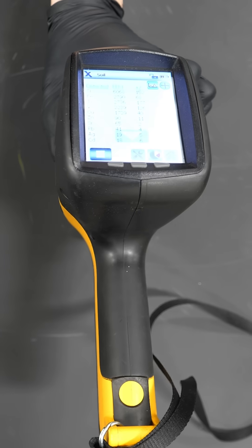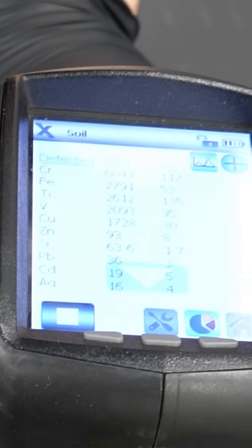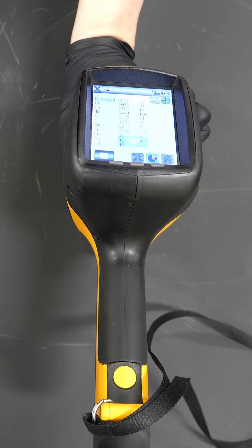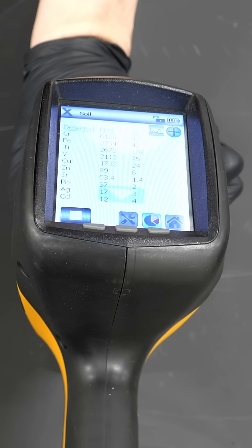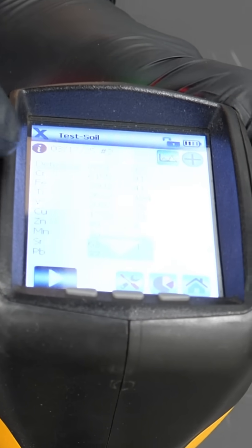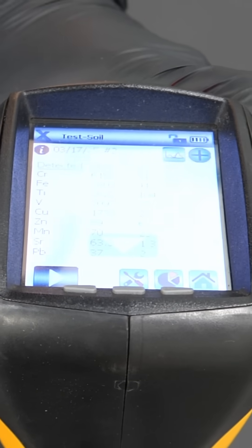It's telling us there's actually a lot of chromium in this table. It won't detect carbon and other light elements, but these are the elements in the wood — or at least in the paint, probably the black paint on top. It has iron, titanium, vanadium, copper, zinc, manganese, strontium, and lead. So there's lead in there — that's cool.